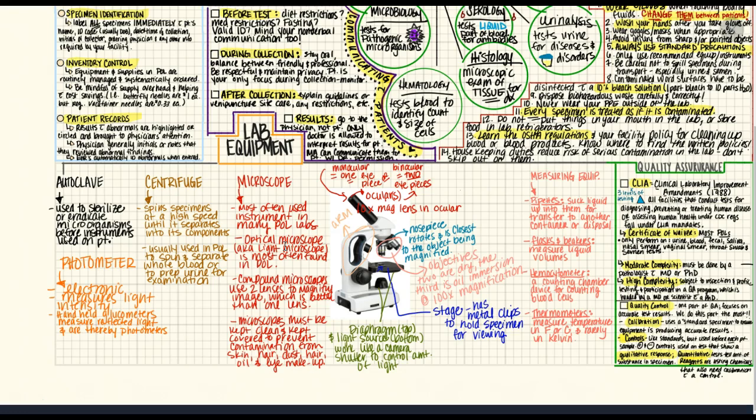Another one is a photometer, and it's an electronic device. It's usually pretty small. Some of them are actually really big, but the ones that we use are pretty small, most of the time handheld. And it is a device that measures light intensity. One example that you will see in our lab are the handheld glucometers that measure the reflected light in blood sugar. Even though the glucometer is measuring the blood sugar levels, they are also thereby photometers because they are measuring reflective light in the blood.